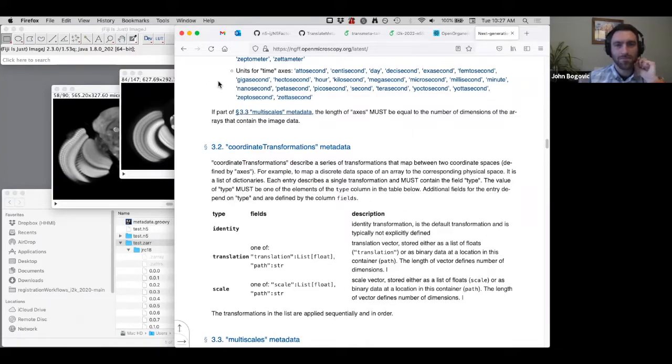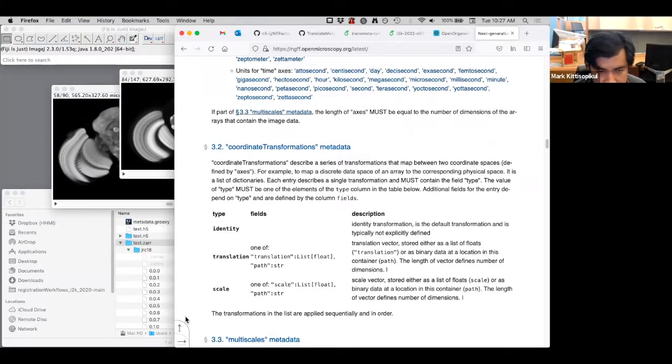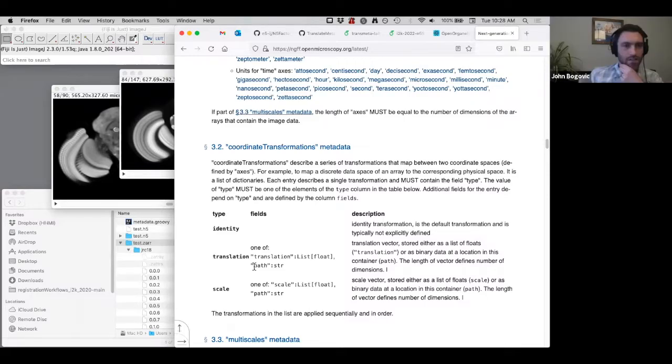Yes, thanks, Mark. I think this is only specified for Zarr itself, right? But I think it's close enough that we probably could port it to H5 and maybe even put it in something that looks like your JSON files for N5. Yeah, that's entirely true. I intend to use essentially exactly this metadata for N5s also, and I think you're probably right that having this in HDF5s would work well. I guess Christian or someone else, do you know if this has been done already actually?